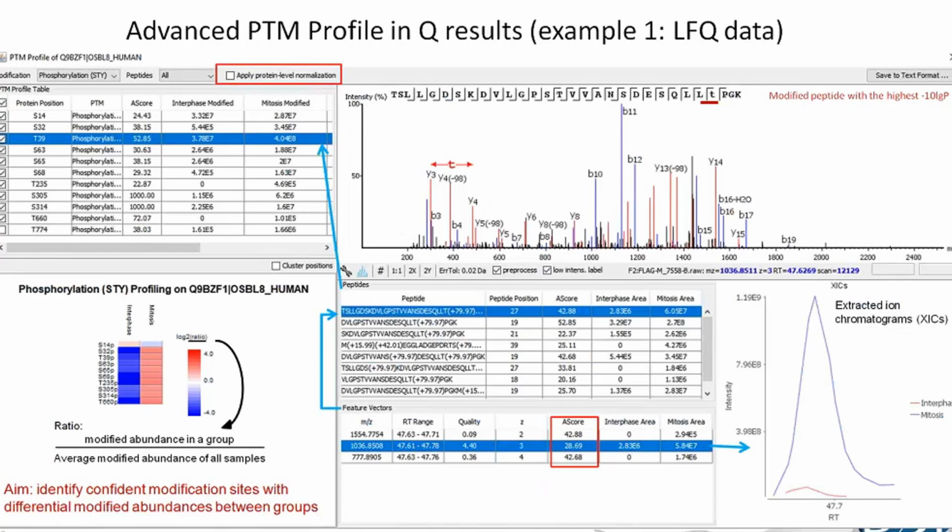Some of the other added tools that you'll have here, so you'll notice here in the bottom right, that we have the areas broken down in much more detail. So as well as being able to see the peptide areas in terms of the areas of the modified peptide and the unmodified peptides, you also need to consider the question, what if that peptide actually occurs in different charge states? So here, just going from the top level down to the bottom, we have the areas reported by position.